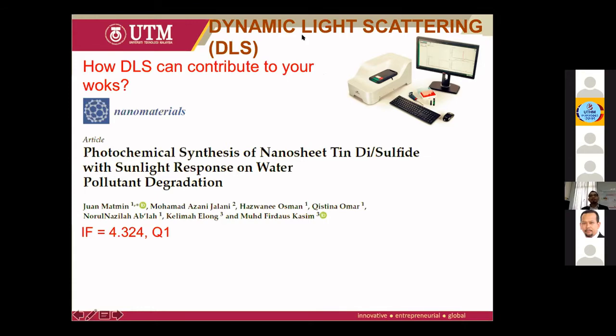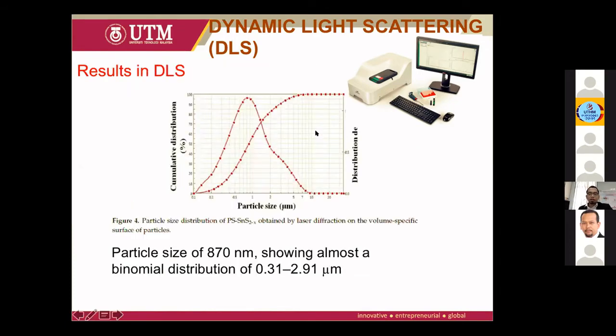Okay, so how can DLS contribute to your work? I remember my work in determining the nanosheets of tin disulfide. It was quite challenging, because nanosheets tend to agglomerate to each other and stack in, and we had difficulties in justifying that it was a nano size. So I collaborated, I remember this work, with some researchers from Germany. They wanted to promote their DLS to penetrate the Asian market. So I said, okay, why not? Let's try using your sample. And this is how they managed to get the size of these nanosheets.